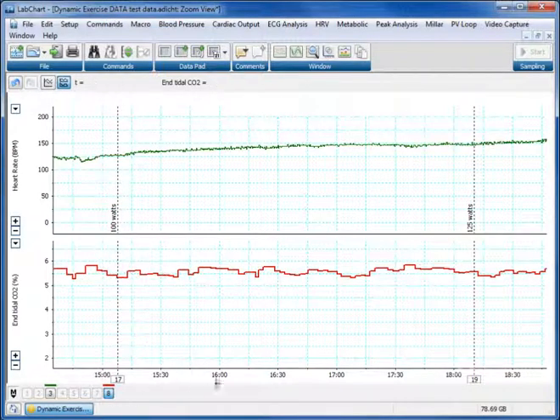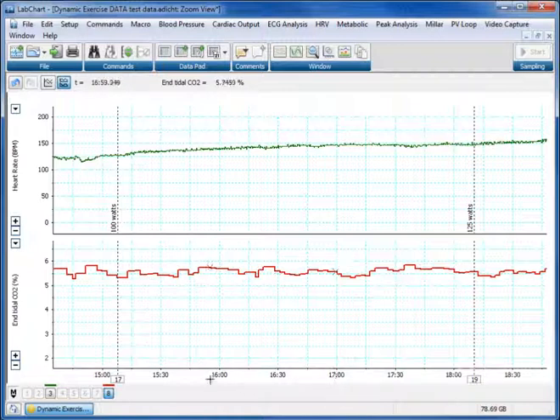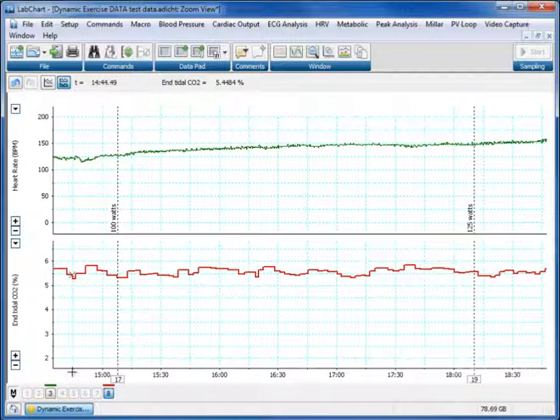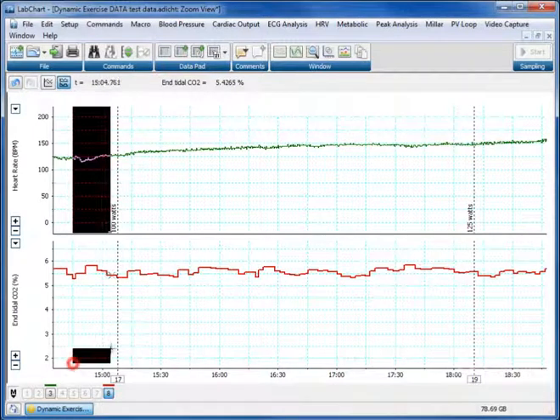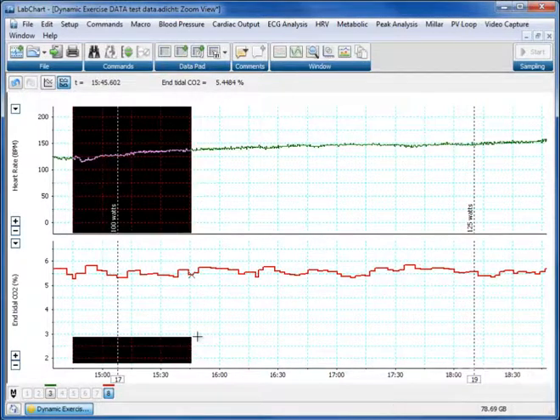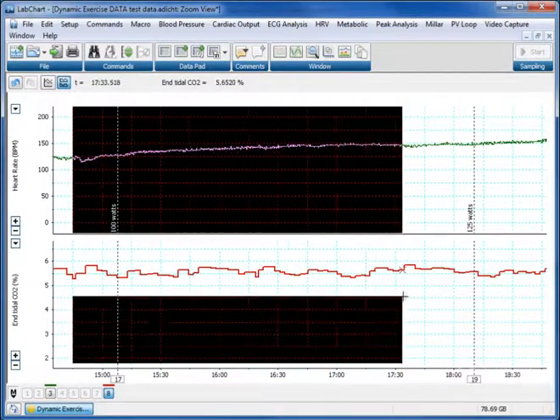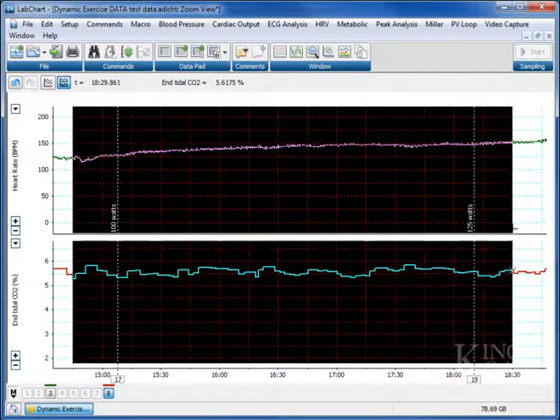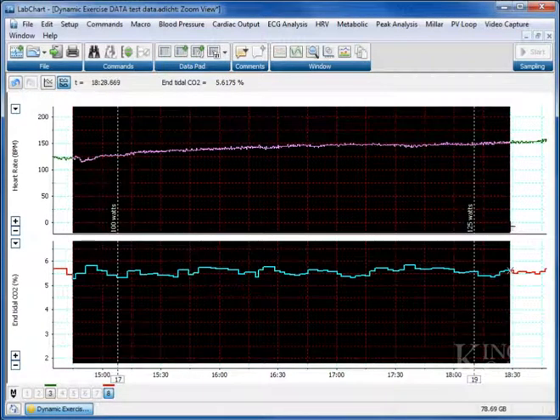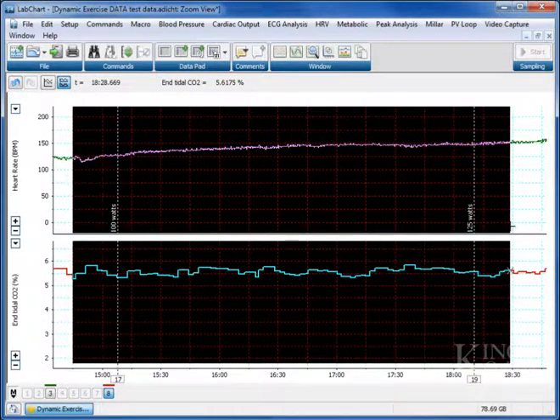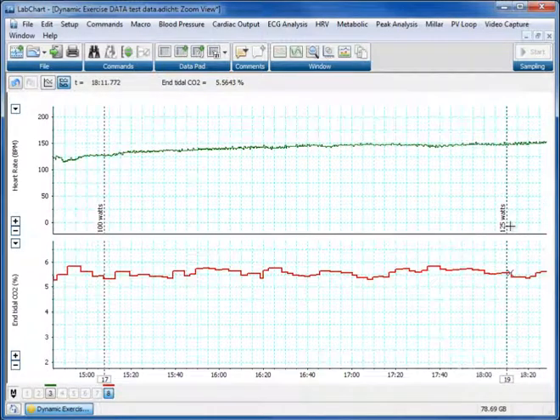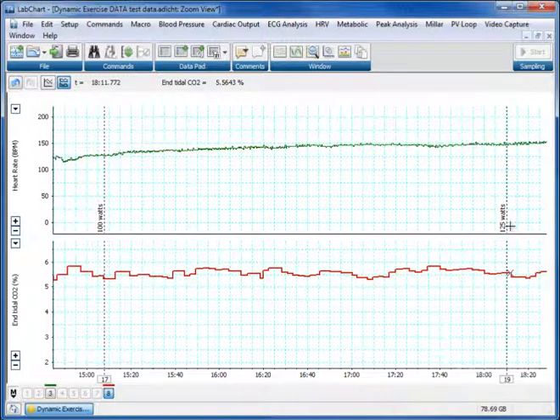So now we want to try and align ourselves so we get the right amount of data. This is 30 seconds, 60 seconds. So this is a minute from this 15 to 16, and each of these is 15 seconds. So let's choose around 15 seconds before the start of our exercise, and let's choose around 15 seconds after. We can trim that off later anyway. So we'll select those data there, and it's automatically cropped and zoomed in, which is great.